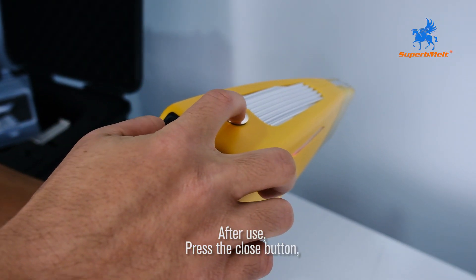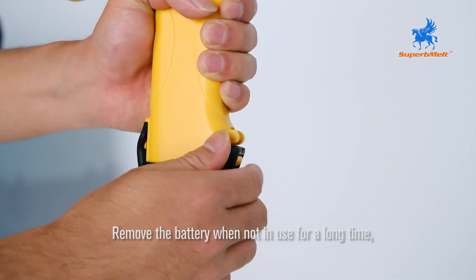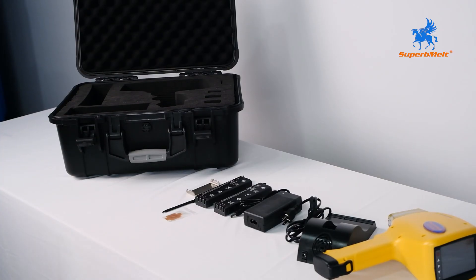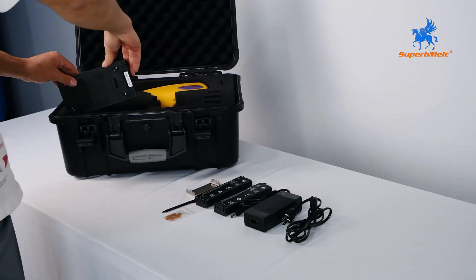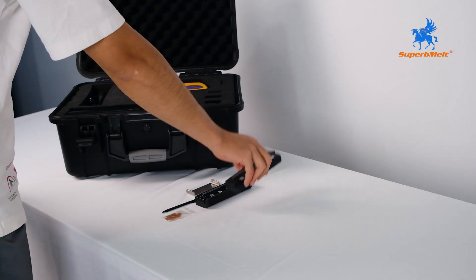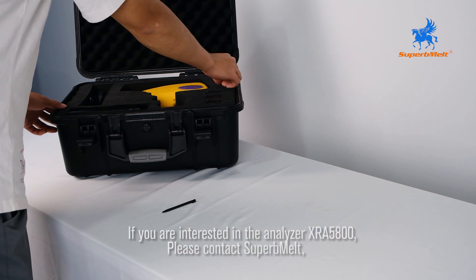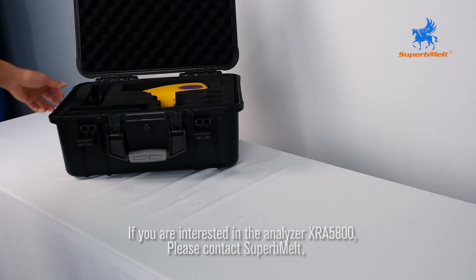After use, press the close button. Remove the battery when not in use for a long time. If you are interested in the analyzer XRA5800, please contact SuperbMELT.